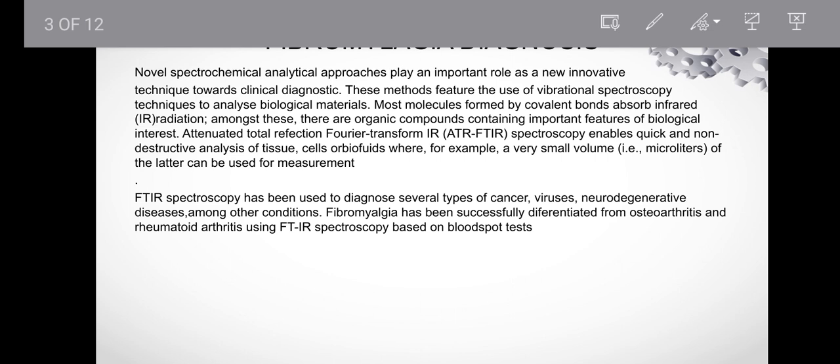If a healthy individual gives a blood sample or a plasma sample, before that, let me make clear how plasma is separated from blood. It is separated from blood using centrifugation. There is a machine called a centrifugal machine. So we usually separate plasma from other components of blood using this machine, a simple technique.